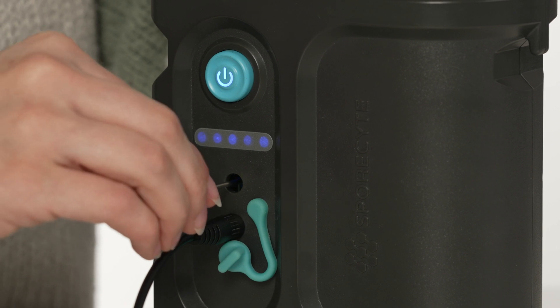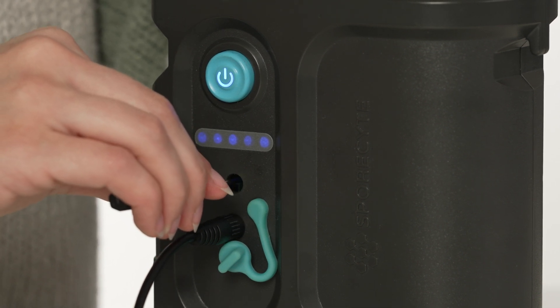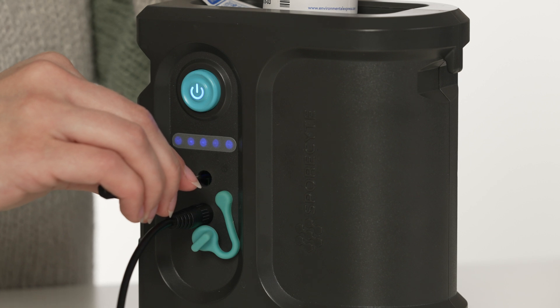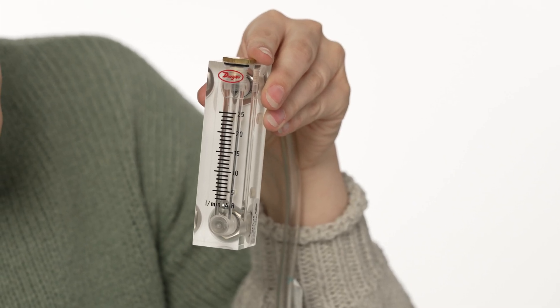Using the screwdriver provided in your kit, gently adjust the flow rate to 15 liters per minute by turning the recessed screw clockwise to increase flow or counterclockwise to decrease the flow, until the center of the float ball stabilizes on the 15 mark.